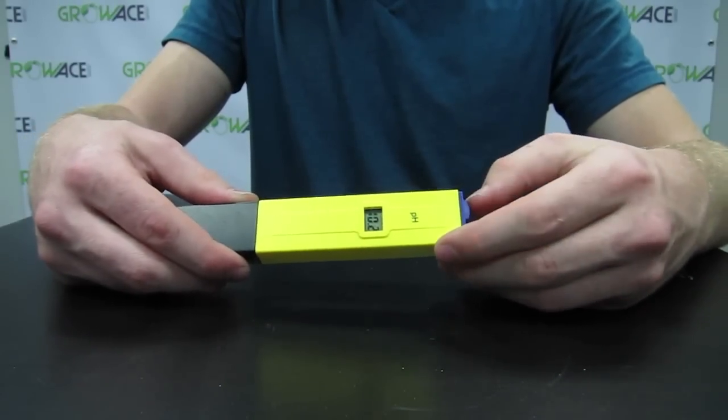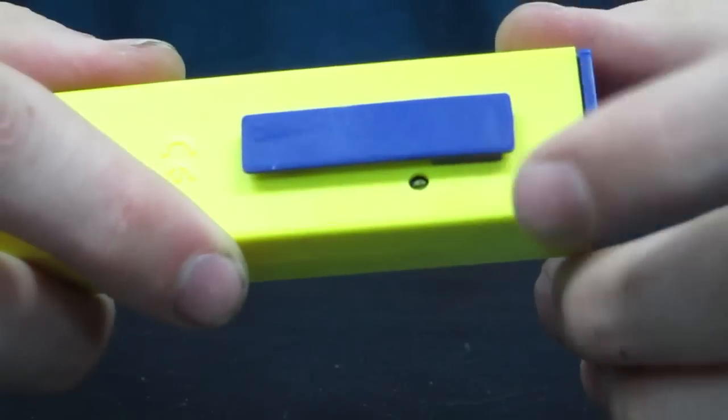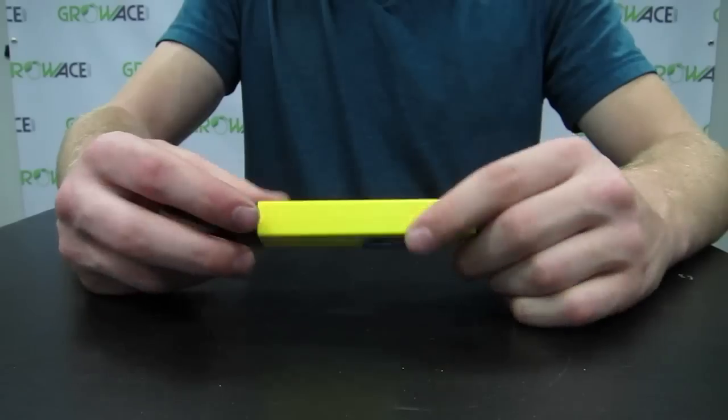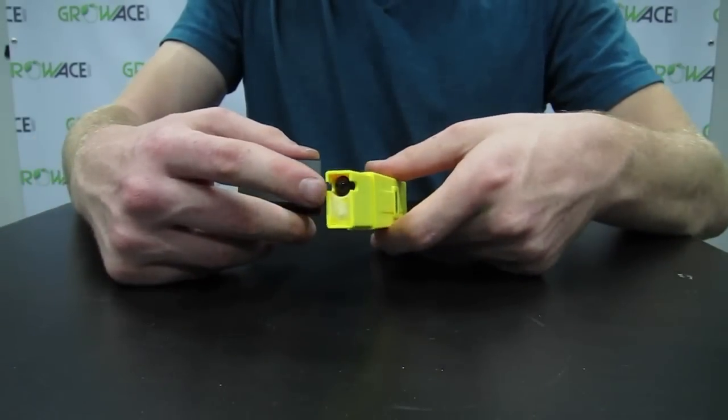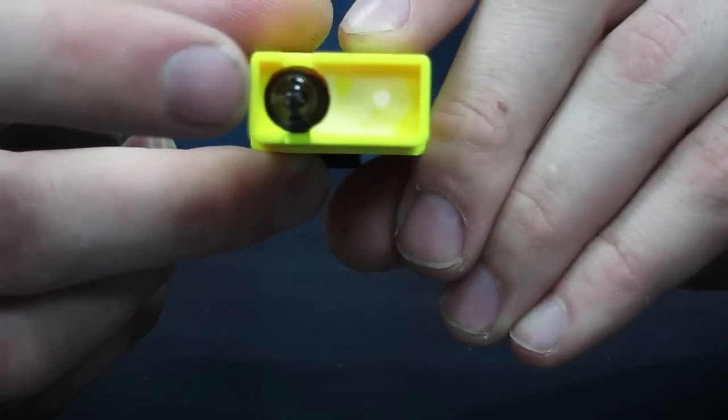Then you have your display. Flip it over and you'll see a calibration screw. Remove the cap, you'll see the electrode. It's important to keep the electrode clean and distilled. Keep it dry before recapping.